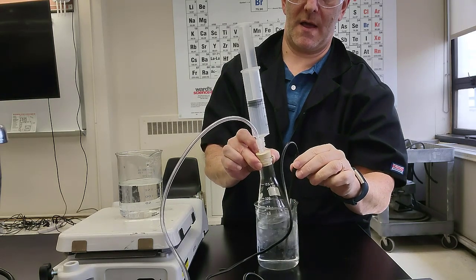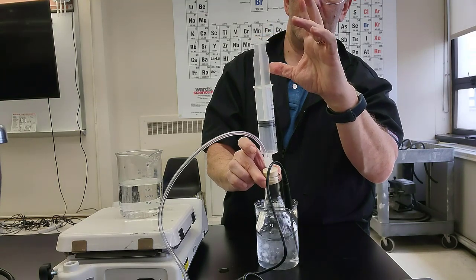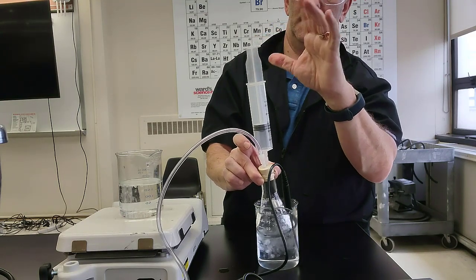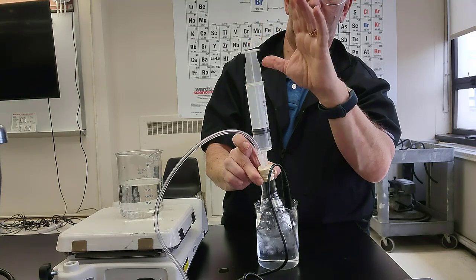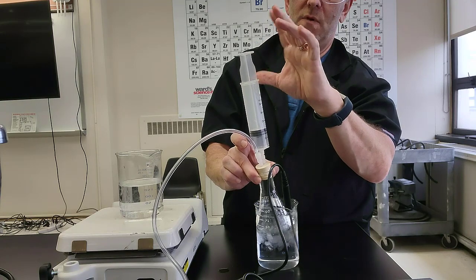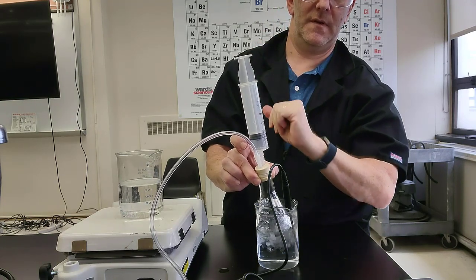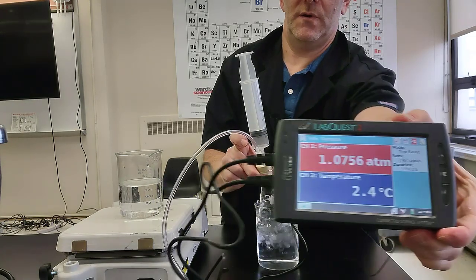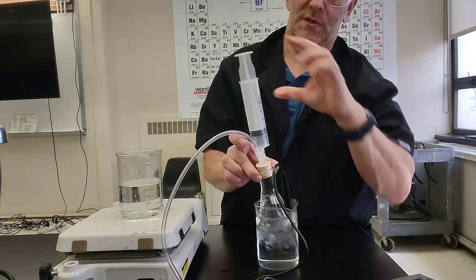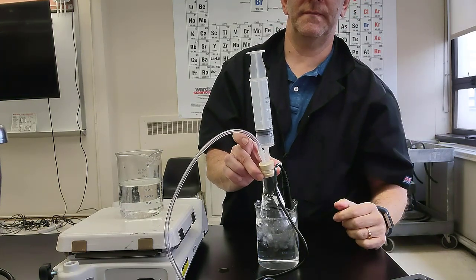I go into the ice bath. And keeping it at 1 atmosphere, letting the gas expand and contract, move the syringe freely. At 1 atmosphere, at close to 0 degrees, we went back down to around 12.5 milliliters.